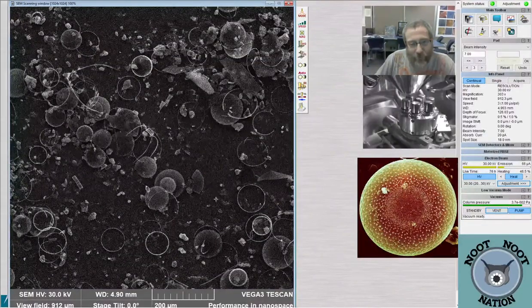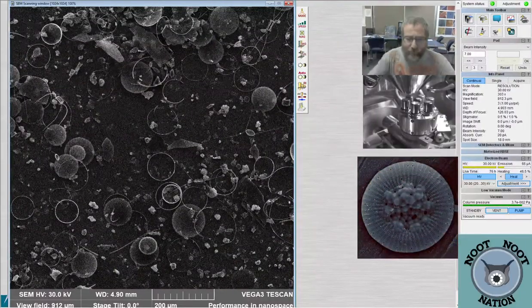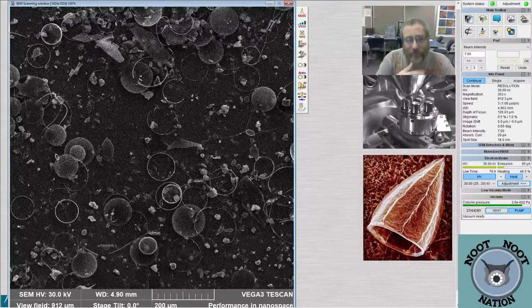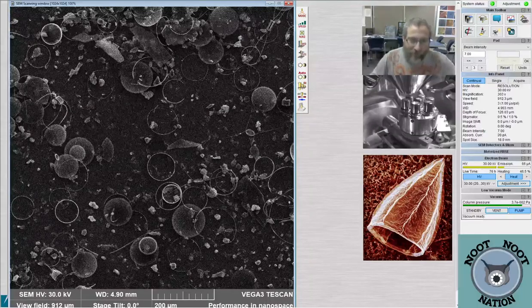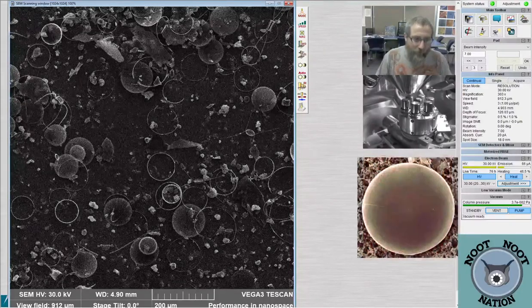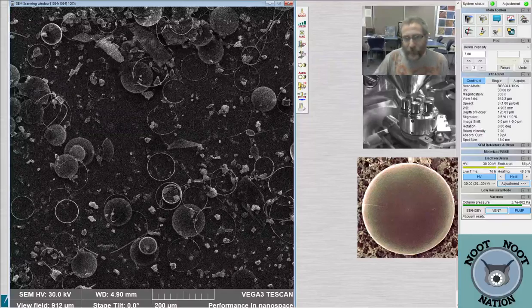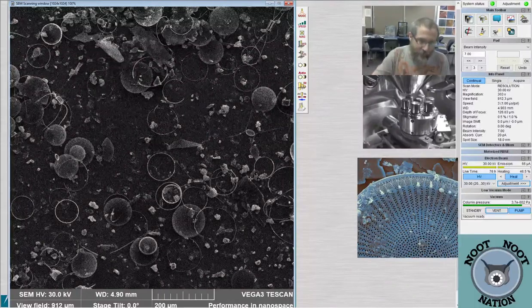The other control that you can change is the beam intensity, which is basically the size of the pixel, or really the size of the information, the thickness of the beam. I like to explain it like a Sharpie. If you use an ultra-wide Sharpie and you draw, it bleeds. The line you draw is very bold and dark, but it also has fuzzy edges. If you were to move to a normal size Sharpie or an ultra-fine point Sharpie, that's basically changing the beam intensity. It's like how much of the information at that line is coming back for each pixel.